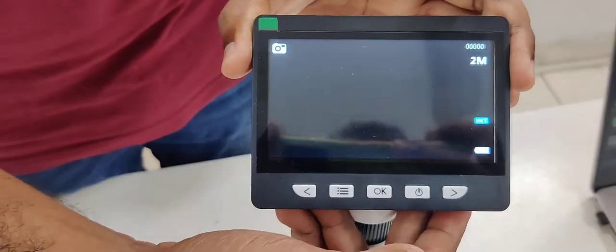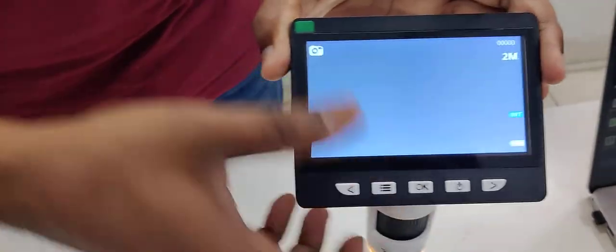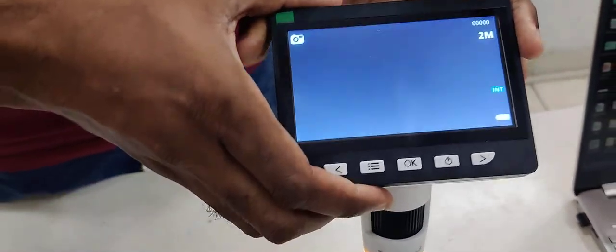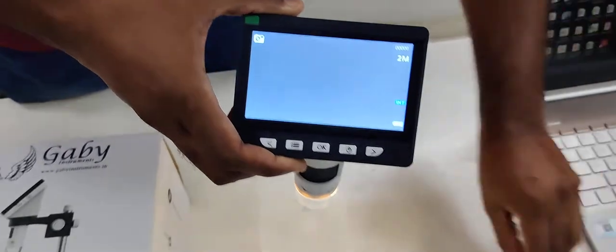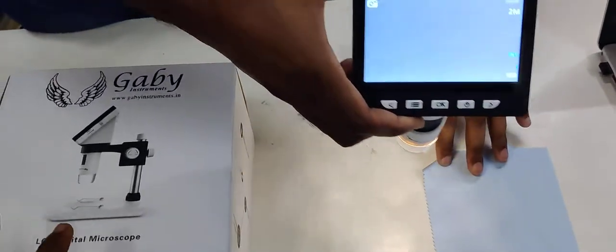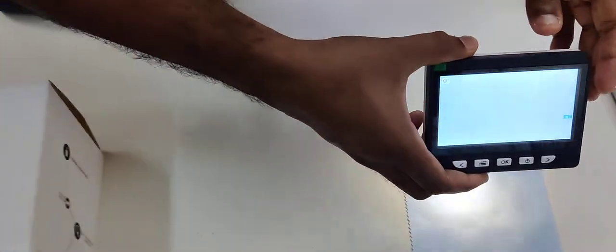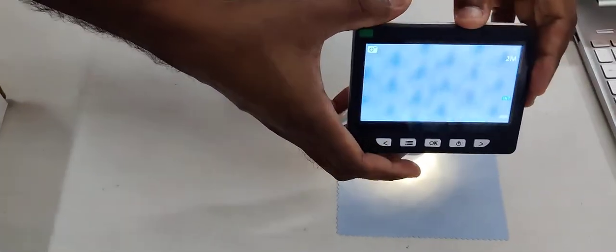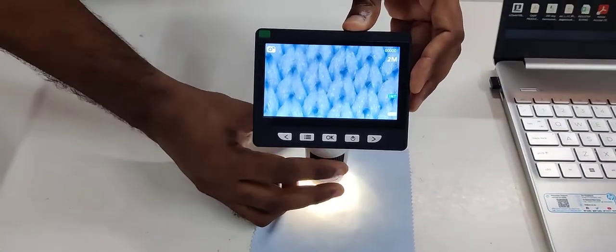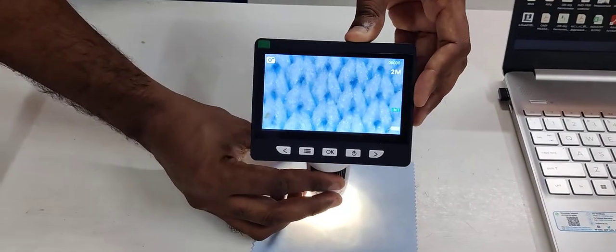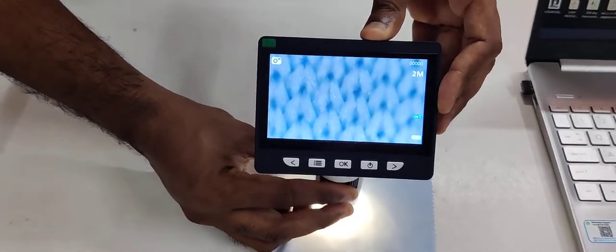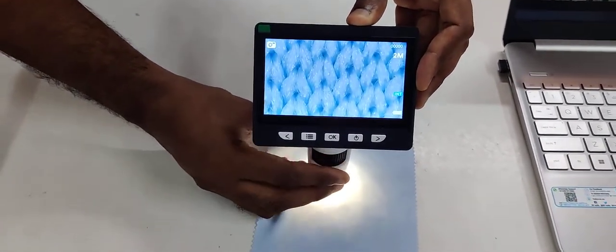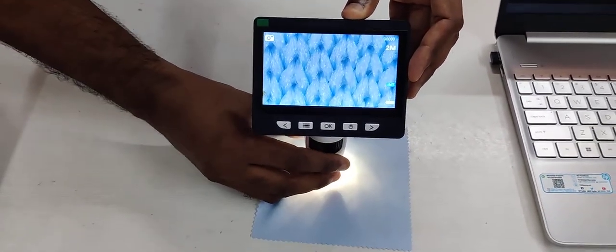Just switch it on, and keep it on a sample, and just zoom. That's it.